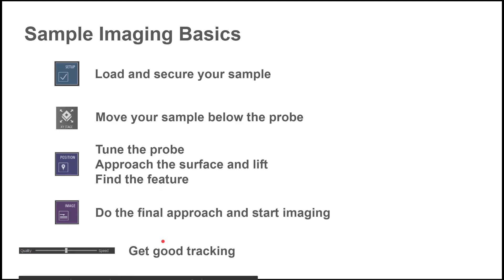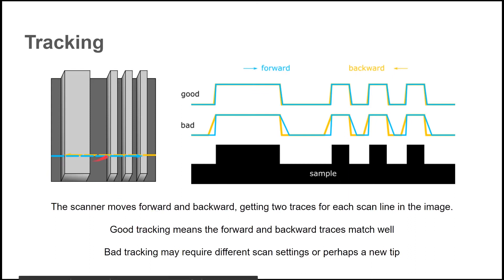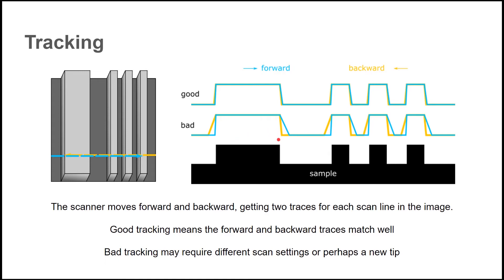While imaging, you should monitor the scan to get good tracking. When taking an image, the scanner will move forward and backward, getting two traces for each scan line. Good tracking means that the forward and backward traces match well. When the tool isn't tracking well, there will be discrepancies between the forward and backward scans. When this happens, you might need to reduce the scan speed, lower the probe set point, or even exchange the probe.